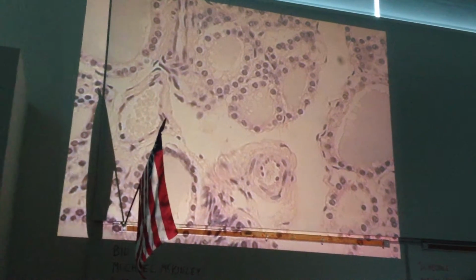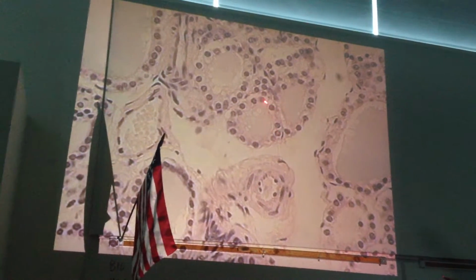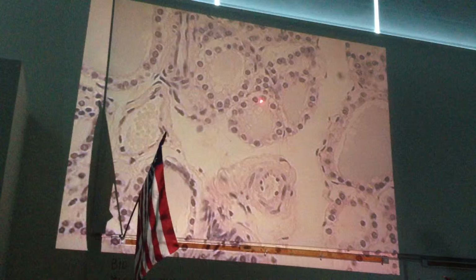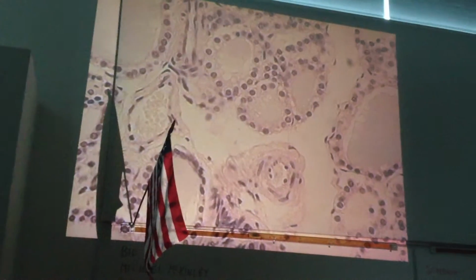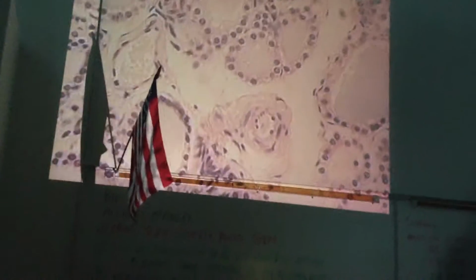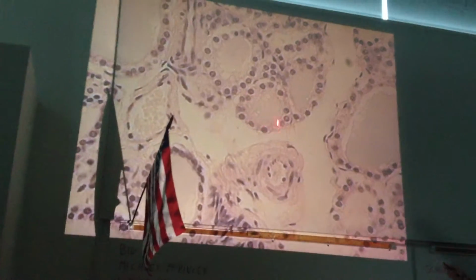It's called a follicle. And the single cell here with the nice spherical shape to it, it's a simple cuboidal epithelium. It's called a follicular cell. It is a single cell that forms the wall of the follicle. It's the one that's helping to form the hormone. Now, in this particular gland, something unique happens, and that is the hormone in an immature state is made and stored inside the space within the follicle.